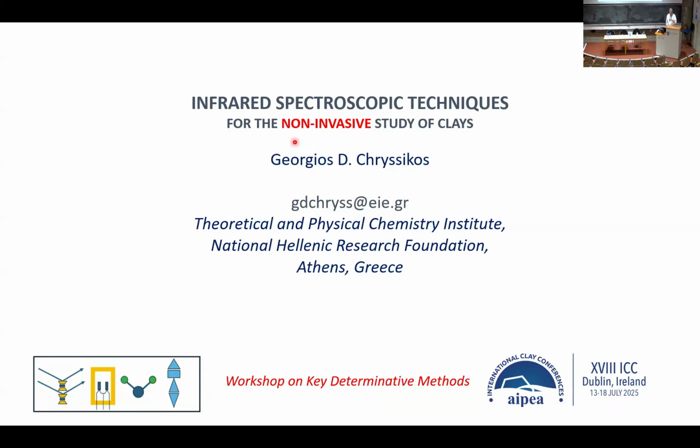your lifetime. I'm planning to introduce infrared spectroscopy as a tool for seeing things. And I want to encourage you to see many clay samples by infrared spectroscopy, because then our brain is tuned to start developing identification criteria. We're very well geared for that. And if we have enough data that are collected in a reproducible way, then we can do a lot.